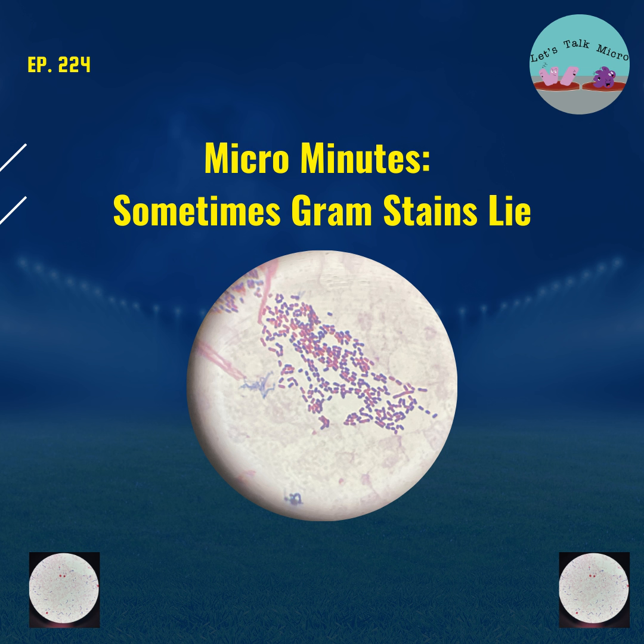Knowing those fundamentals, one thing that can affect your Gram stain results is the age of the culture. Let's say you have an older organism, maybe the cell wall deteriorates, and that can affect your staining. Something else that can affect your staining when it comes to the cell wall is antibiotics. Maybe your sample was collected after the patient was placed on antibiotics, and that can affect your staining.